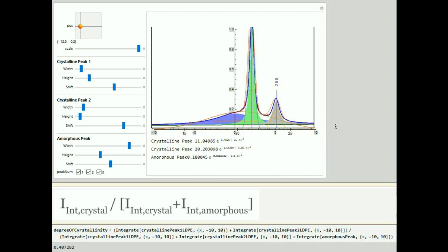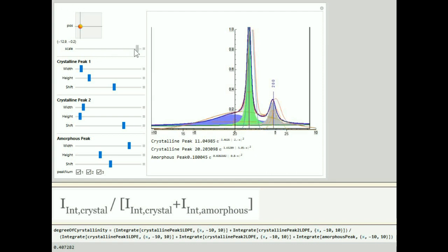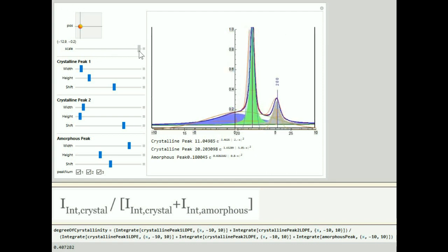First, the code allows the user to adjust the position and the scale of the XRD pattern. The user is then able to adjust the positions of both the crystalline peaks and amorphous peaks. Once the user obtains a fit that they're happy with, they can calculate the degree of crystallinity by determining the integrated area under the crystalline peaks divided by the integrated area under all of the peaks.